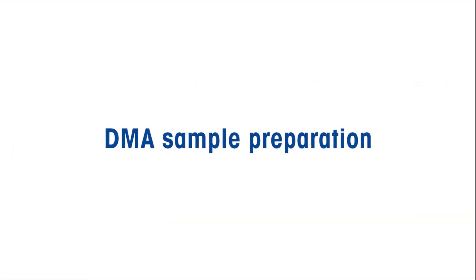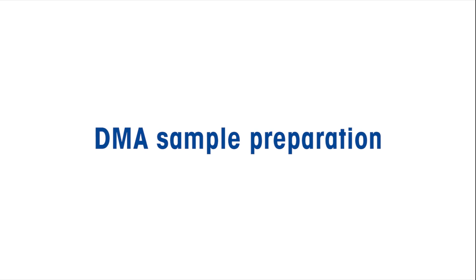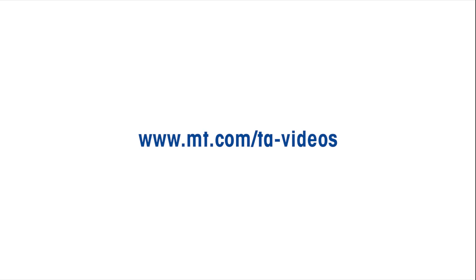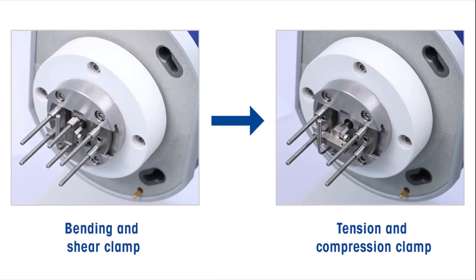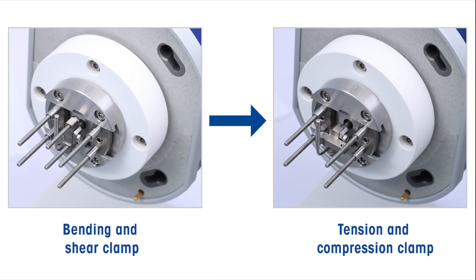Details on sample preparation for tension and bending modes are provided in the DMA sample preparation video at www.mt.com/ta-videos. We have shown you how to change a bending or shear drive shaft clamp to a tension or compression drive shaft clamp.